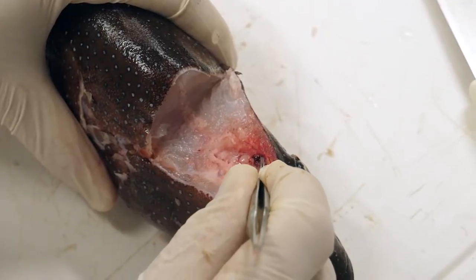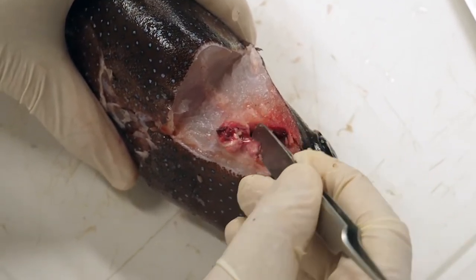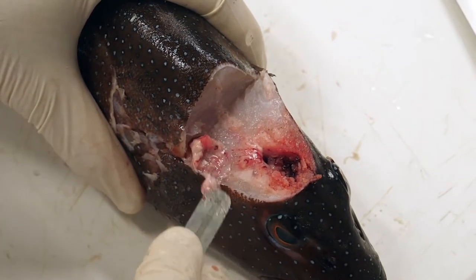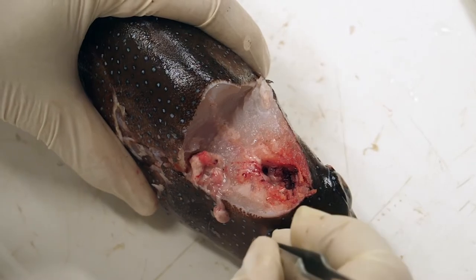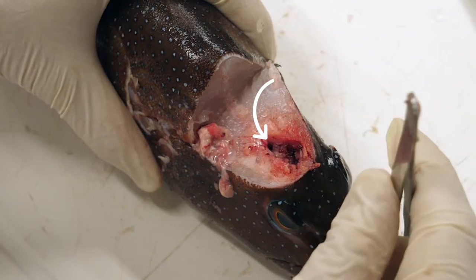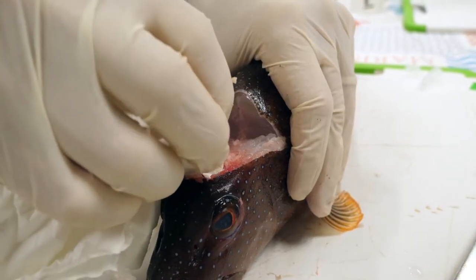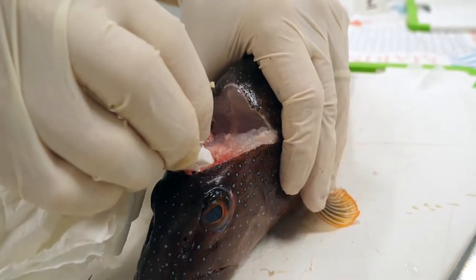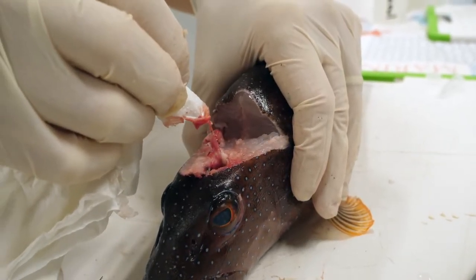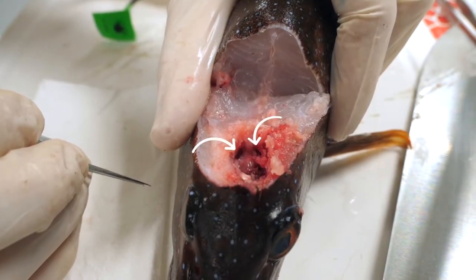Use the back end of the tweezers to remove the fish brain. Careful! The otoliths of some species are very fragile and are removed very easily. You must be very careful to avoid damaging or losing them. At this stage, the cavities where the otoliths are located are visible at the bottom of the skull cavity on the spine side. If they are not, you can carefully insert absorbent paper into the cranial cavity to absorb the blood and tissues that are blocking your view of the otolith cavities.